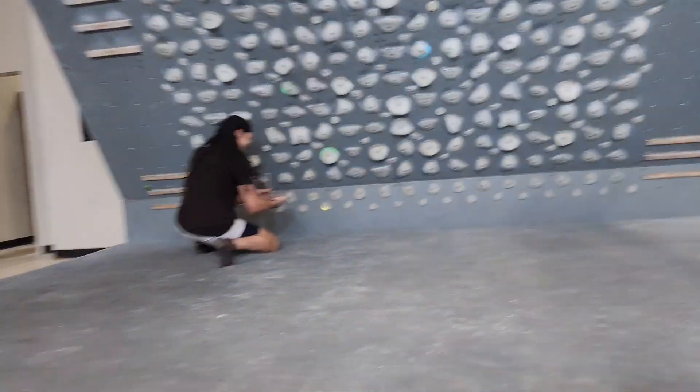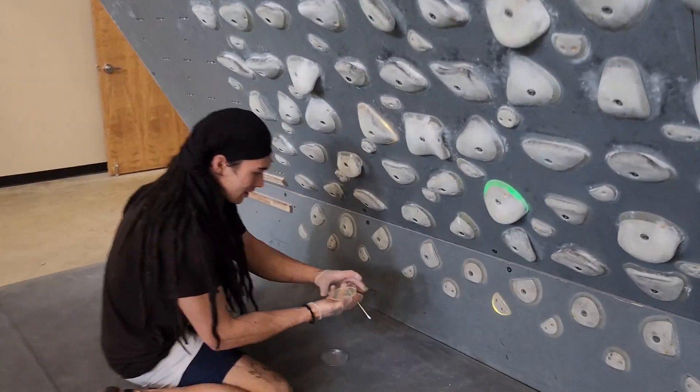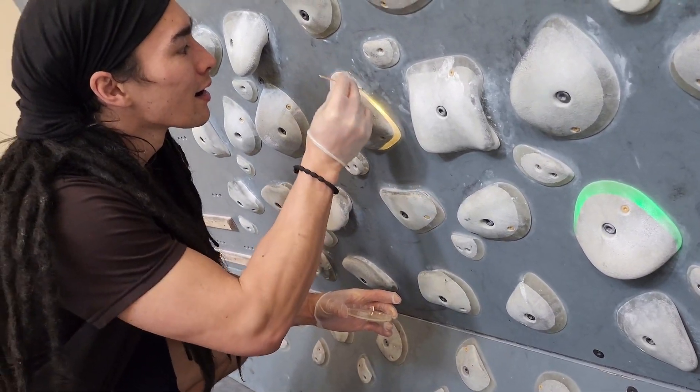McKenna got really sick one day and was out from the gym for about two weeks. During that time I got kind of bored and slightly neurotic, so here I am genuinely curious what's growing on these climbing holds.